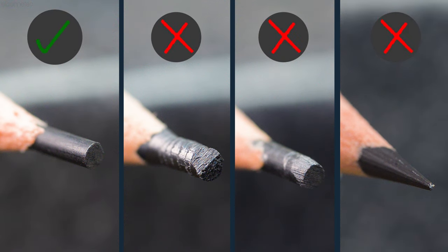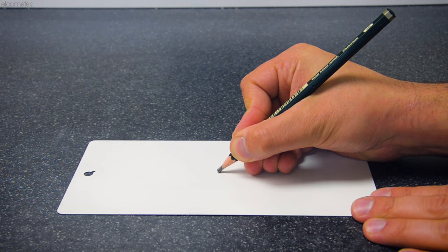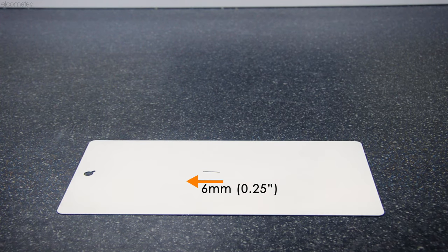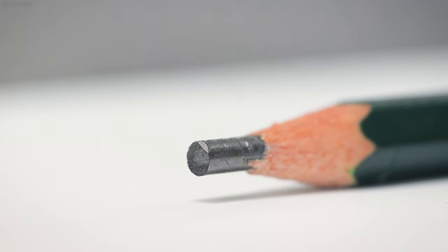You're now ready to perform the test. If you're completing the test freehand using the Elcometer 3080, with the test panel on a level, firm, horizontal surface, hold the pencil firmly at a 45 degree angle to the surface and push it away from you about 6mm or a quarter of an inch at a uniform speed, applying sufficient downward pressure to either cut or scratch the coating, or crumble the edge of the lead.